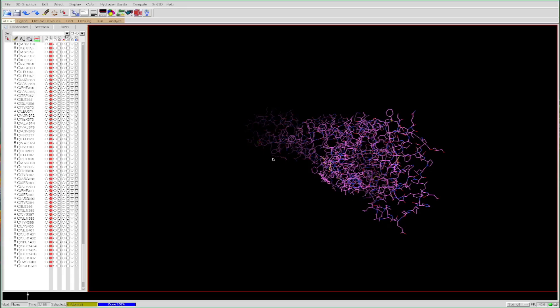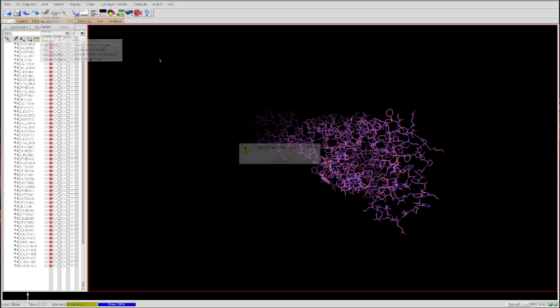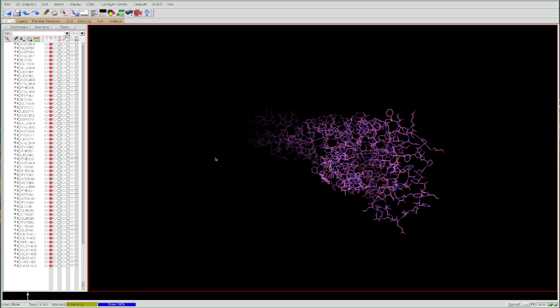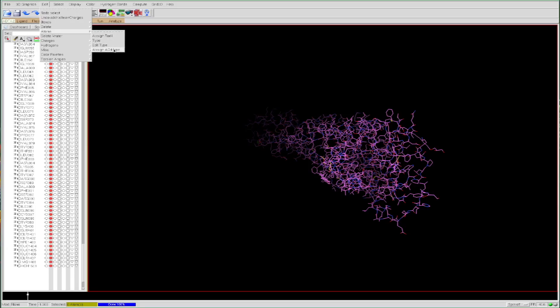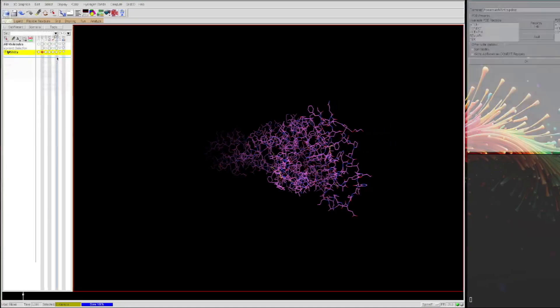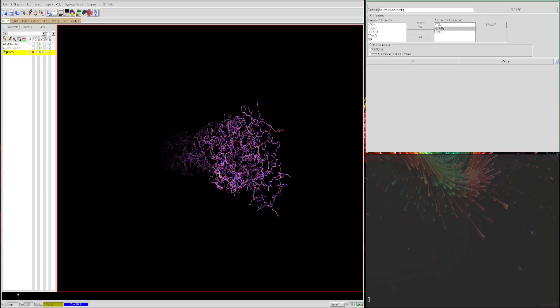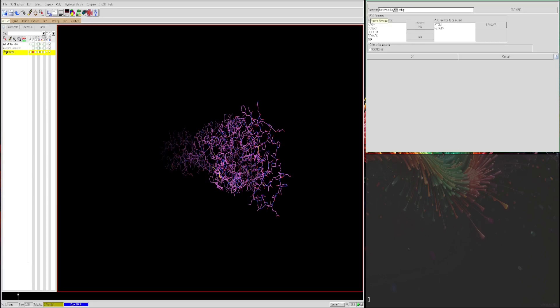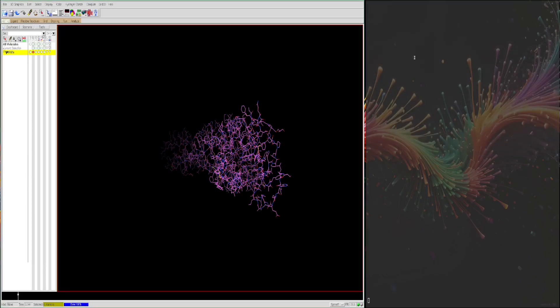In order to prepare the receptor for use in AutoDock Vina, we need to assign a few things to the atoms. First, assign charges by pressing Edit > Charges > Add Gasteiger charges. Then assign an AutoDock element field by pressing Edit > Atoms > Assign AutoDock 4 Type. Finally, save the receptor as a PDBQT file via File > Save > Write PDBQT. Before saving, remove the CONECT records — go to CONECT and press Remove. Then rename the file to 5ht2a.pdbqt and click OK.